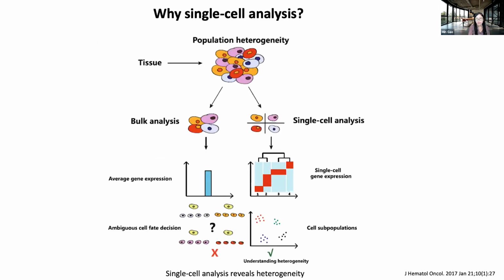As we know, the fundamental unit of an organism is a single cell. Each cell or cell type may have distinct functions. Research on single cells provides great insight into our understanding of biological diversity and the mechanism of some diseases. The traditional experiment only works on bulk samples.